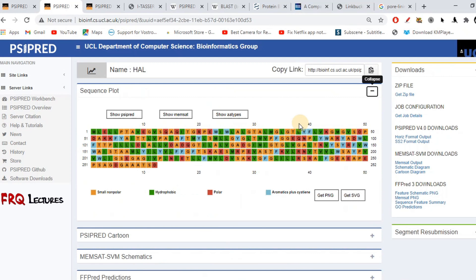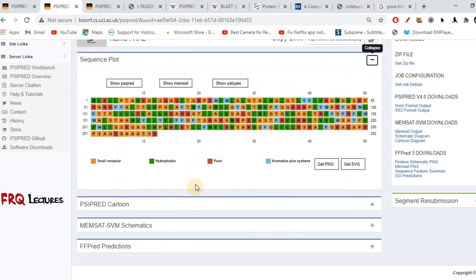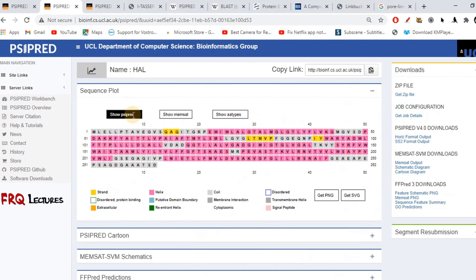After 10 to 15 minutes you will see the results screen, which has four sections. In the first section we have three colors: pink represents alpha helices, yellow represents beta sheets or beta strands, and light gray represents loops connecting different secondary structure elements. This is the same amino acid sequence starting from methionine and ending at aspartic acid, with approximately 262 amino acids in this protein.